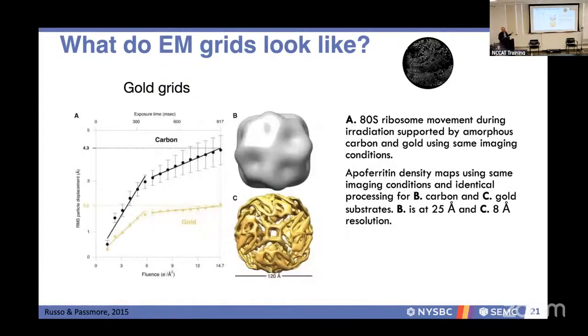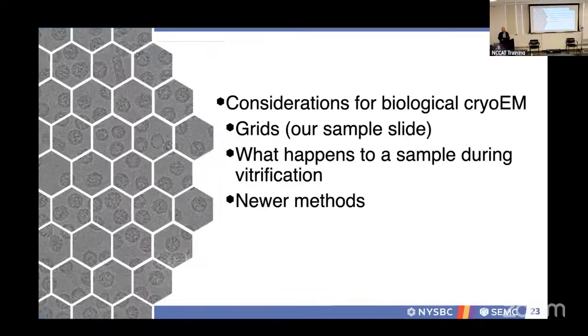But what you saw in the video, hopefully, is really outlined in this particular paper, where when they had a metal grid with either a carbon foil or a gold foil, there were different contraction rates. And that also affected the motion of the samples in the grid.